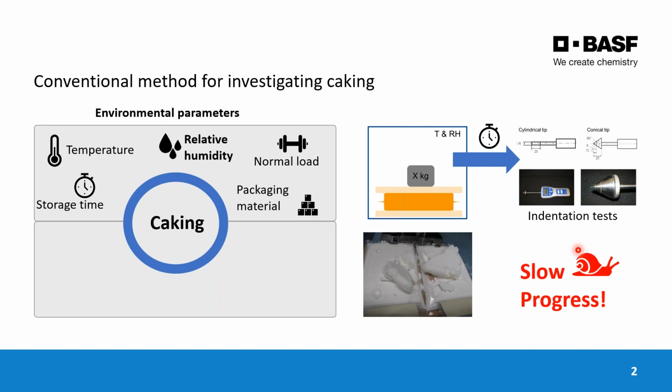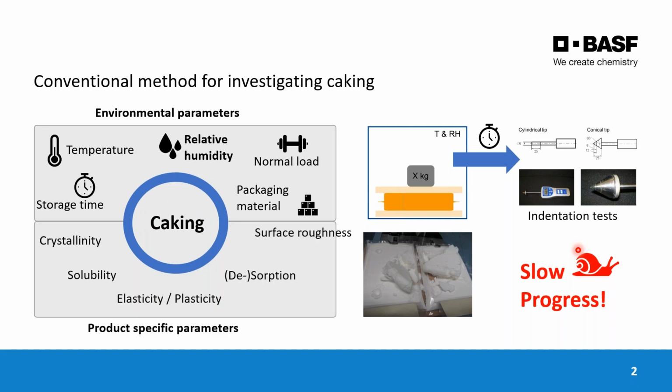These tests are typically set up on a 3-month basis. So the mission in this project was, how could we determine the propensity of a material to cake and not take 3 months to give you the answer? Ideally, we want to give the answer that day. That's the overall mission of this project.